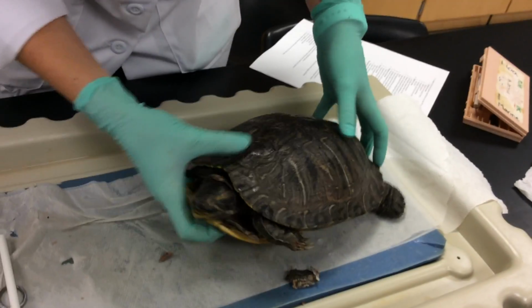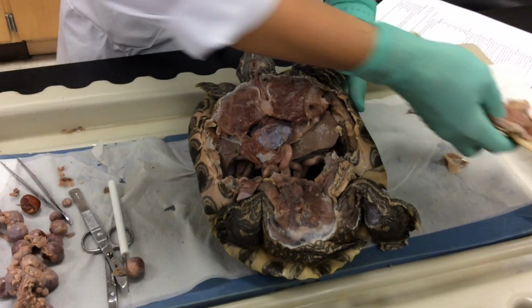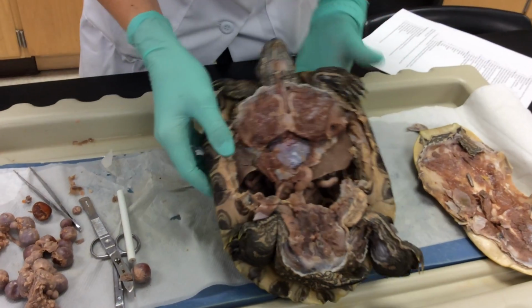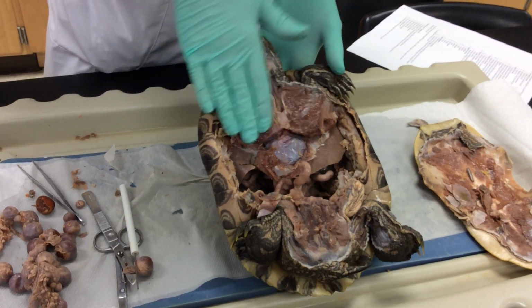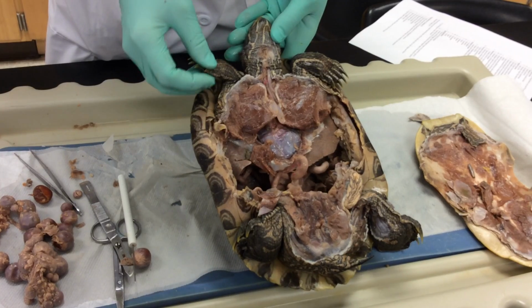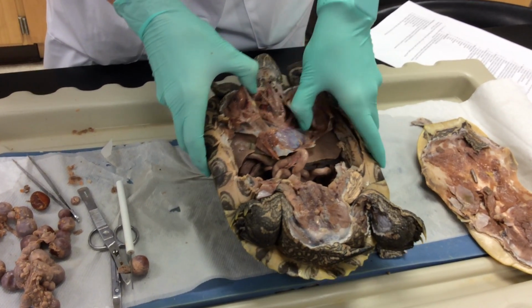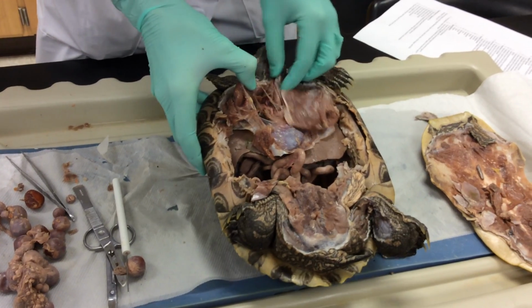Alright, so now we're going to look at what the inside of the turtle comprises. So I'm going to remove the plastron. Lots of connective tissue and muscle there. This region is the pectoral girdle, and this is the pelvic girdle. In order to see some of the things, we're going to have to pull this back a little bit. We're going to start with the respiratory system since we talked about the nares.